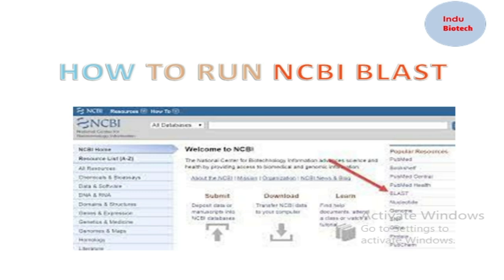In the last video, we discussed the theoretical part of the BLAST search tool, and today we will discuss the practical of the BLAST tool.